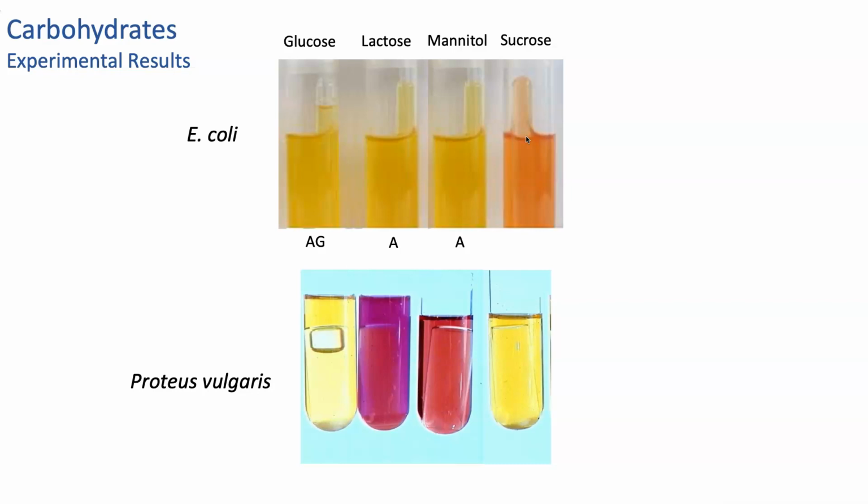So what we see here is sort of an ambiguous result. I would say that this is negative. But when you look at your DIFCO chart in your manual, that's on page 78, and you scroll down that first column of E. coli, all the way to the bottom, you'll see the experimental results for sucrose.